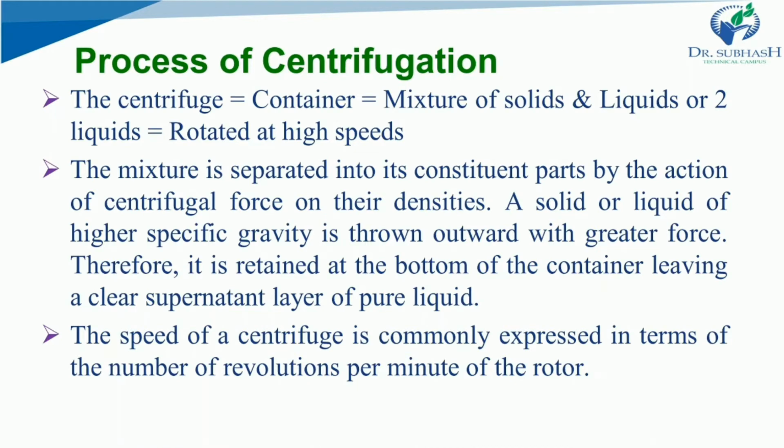The mixture is separated into its constituent parts by the action of centrifugal force on their densities. A solid or liquid of higher specific gravity is thrown outward with greater force. Therefore, it is retained at the bottom of the container, leaving a clear supernatant layer of pure liquid.